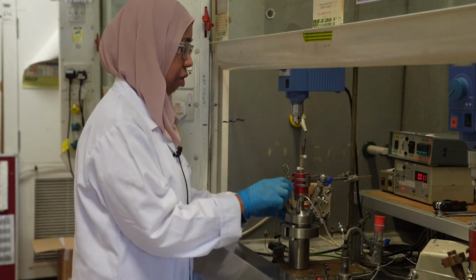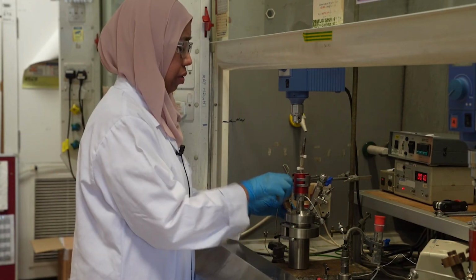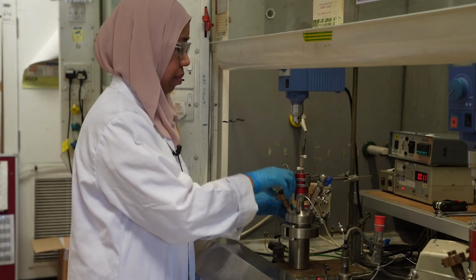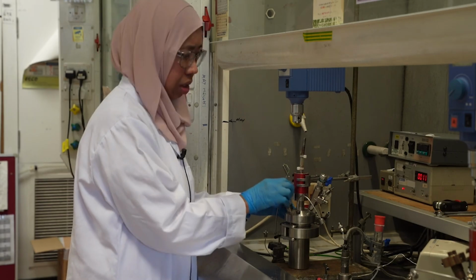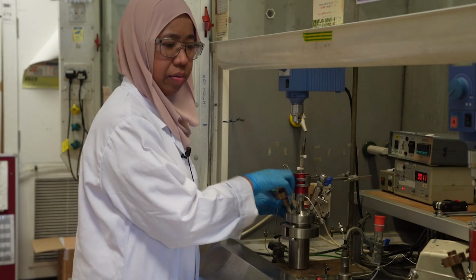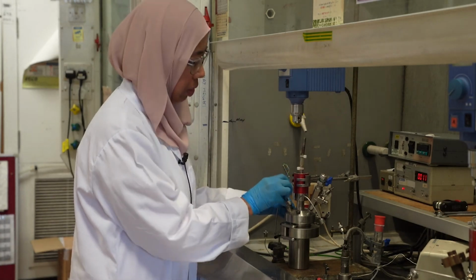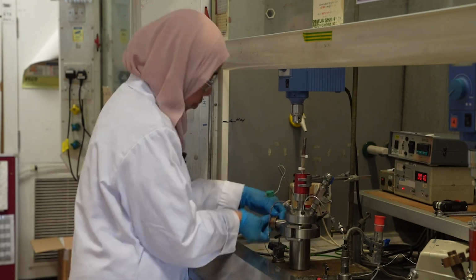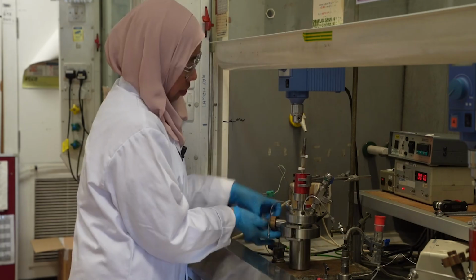So first of all, we open the key and slowly, just to make sure that they are free, they are not under any pressure, and then we open the autoclave there.